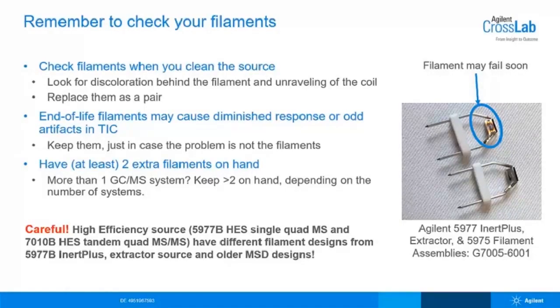And also remember to replace your filaments in pairs. It's better to replace a filament a little too early rather than having a complete failure in the middle of the sequence.